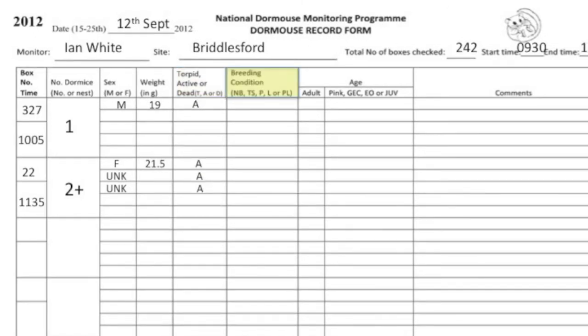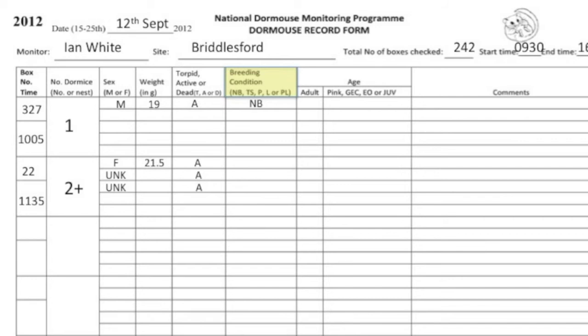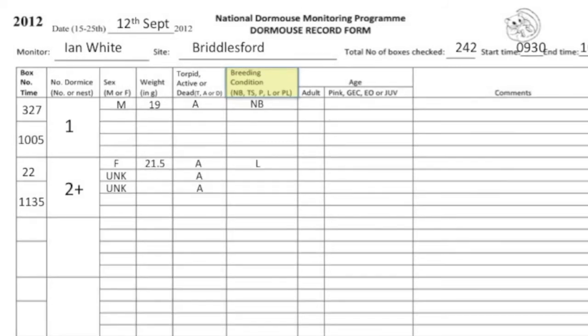In breeding condition, record whether the dormice are non-breeding, testes scrotal, pregnant, lactating or post-lactating.